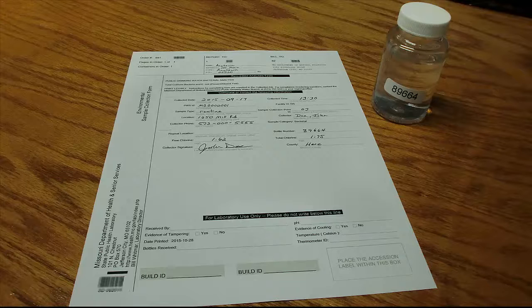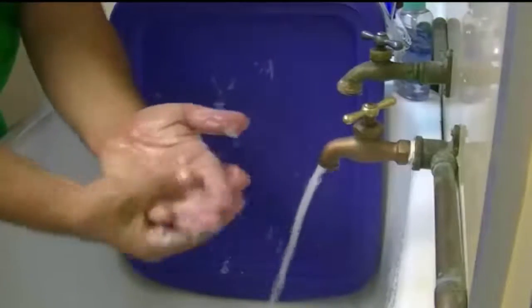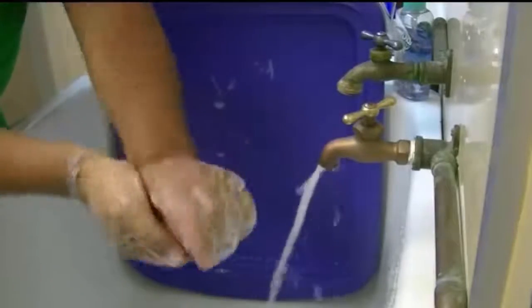While the process is easy, you must be careful to ensure that you don't contaminate the sample during collection. First, have clean hands and relatively clean clothes so that you don't accidentally contaminate the bottle.